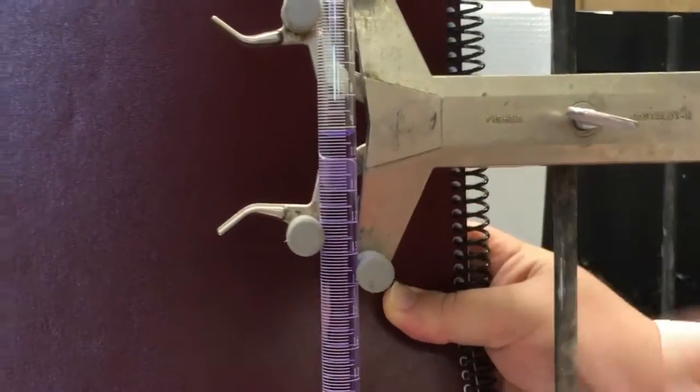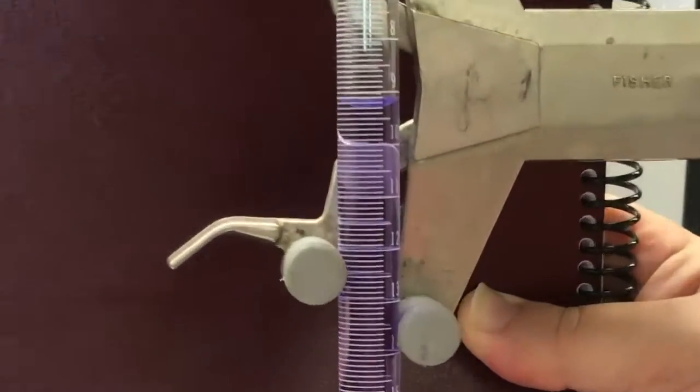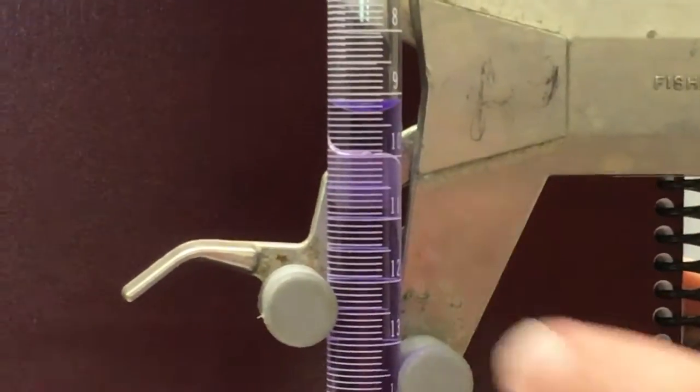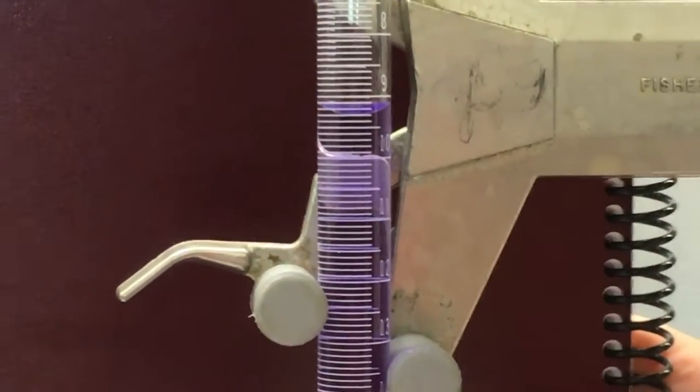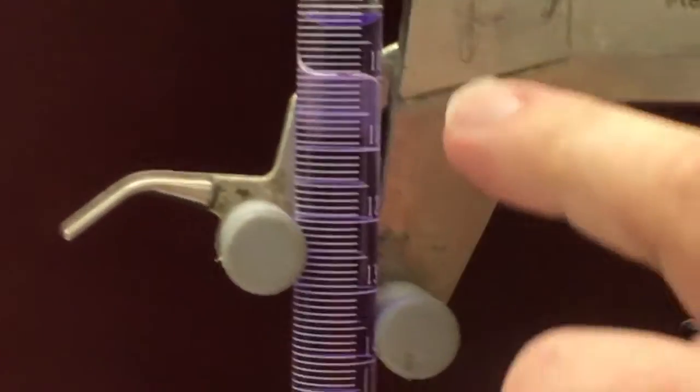So looking at the liquid level here, let's try and get that measurement as the initial volume of solution, okay? So looking at this, you can see there's some curvature to the liquid there. That's called the meniscus. You always take the measurement at the bottom of the meniscus.